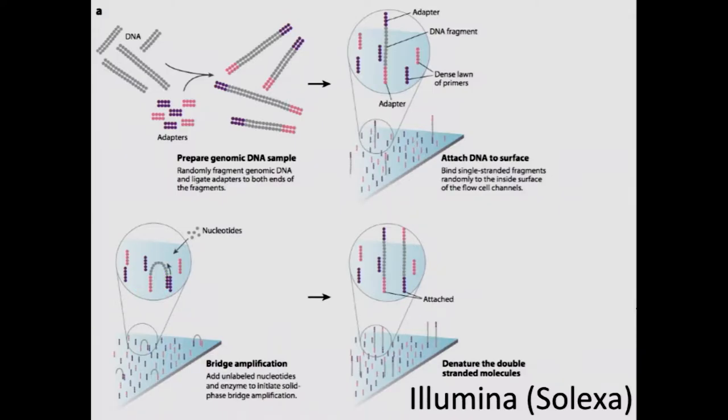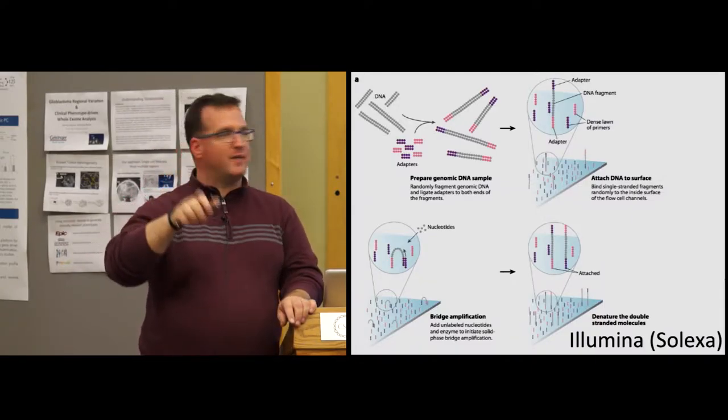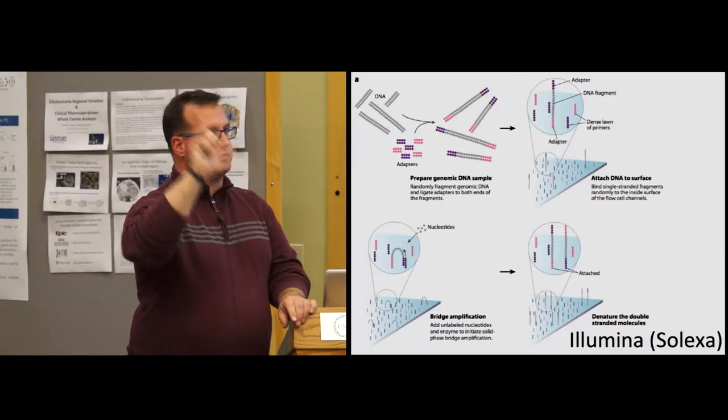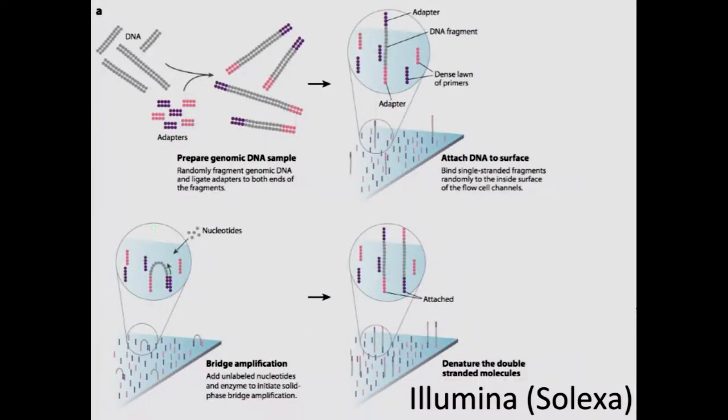Then what they're going to do is a series of PCR reactions. Because the fragment is in that 200 base pair window, and because of the density of the lawn of these primers, the thermodynamics is such that you can get that molecule, while it's waving around, to actually anneal to the other primer, and now you can have PCR occur across that bridge. So this is so-called bridge amplification. And as that second strand of DNA is being produced, there's a lawn of primers right next to it. The daughter product thermodynamically anneals almost instantly to the closest primer, and now you end up having two molecules that are attached. This is just after the first cycle.